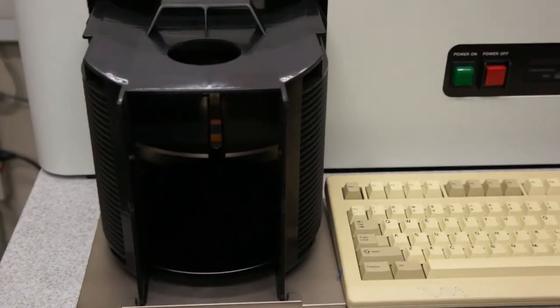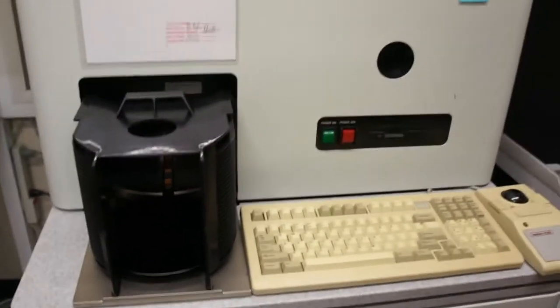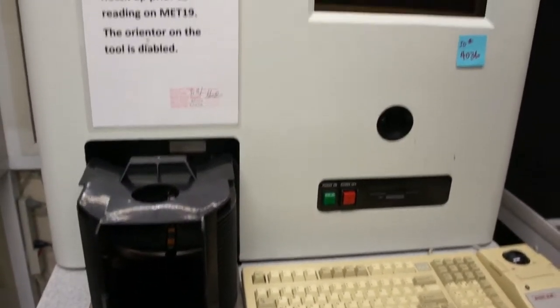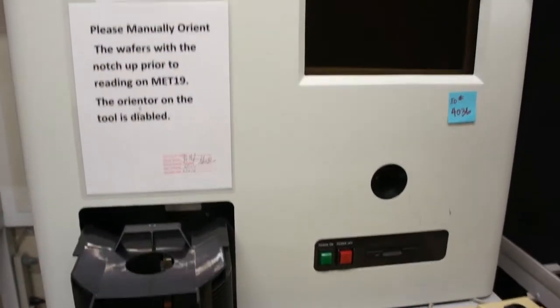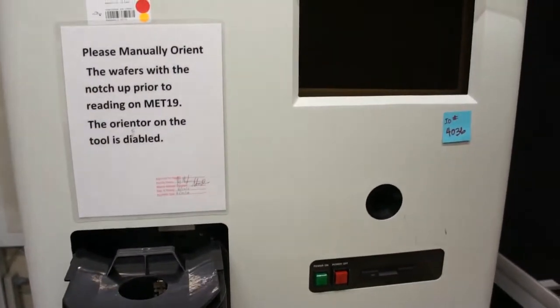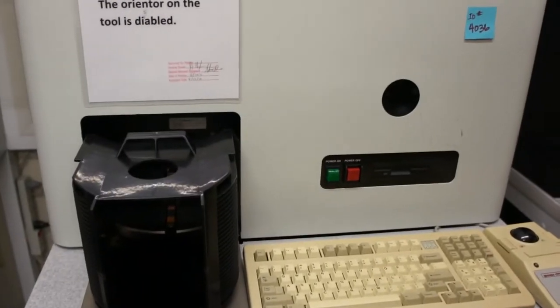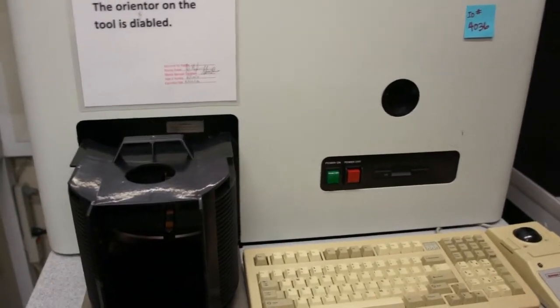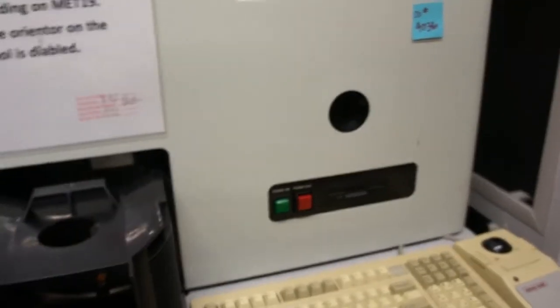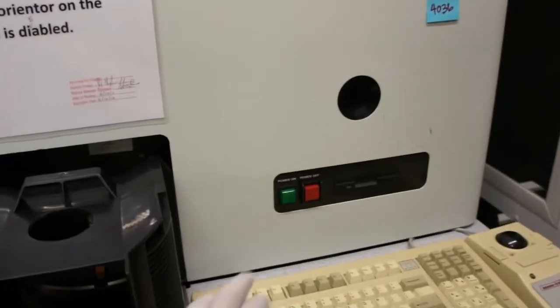So we have an 8 inch cassette and the tool is currently powered down. We're going to demonstrate a full power up and just go ahead and power this tool up.